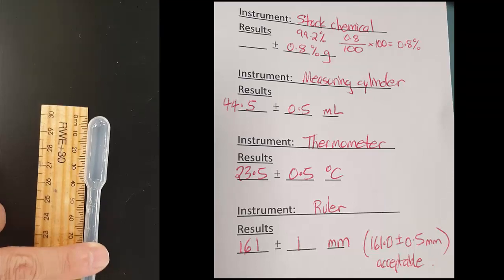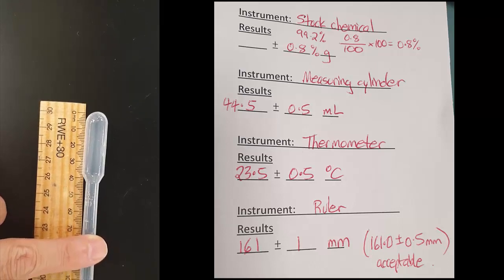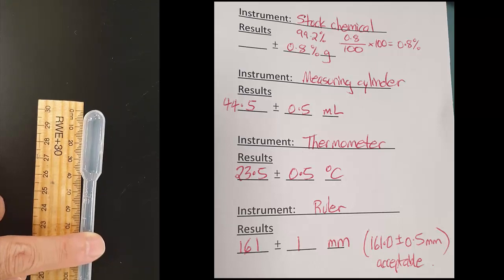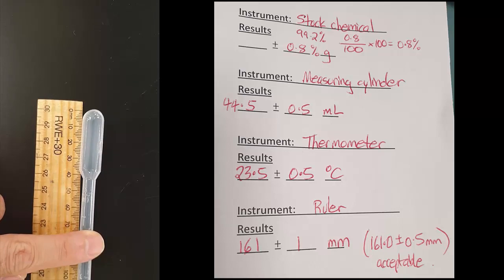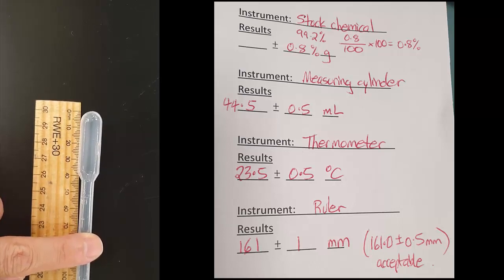Okay, so moving on to the last one. This one's another trick as well, because this one's got a calibration error. So the pasteur pipette, you put it in at the 0, and then the tip goes to, I think it's 161. So if you didn't realize, this is analog, so it's half the smallest increment, so it's 161.0 plus or minus 0.5, but in reality, you took an initial and final reading, so you now have to double it again.